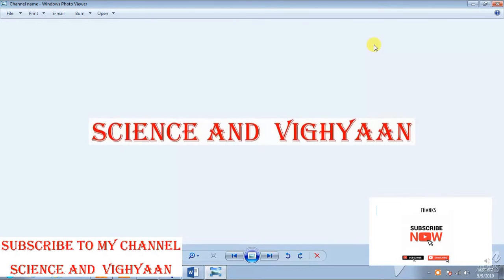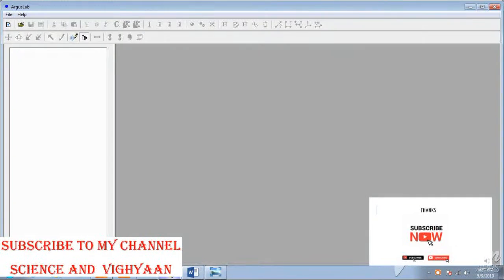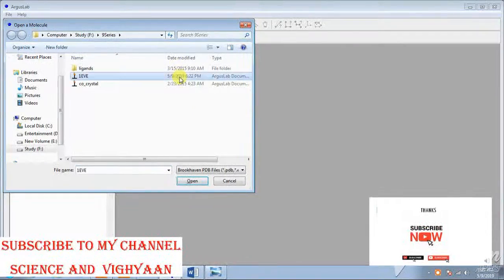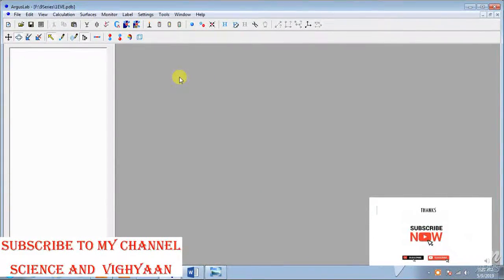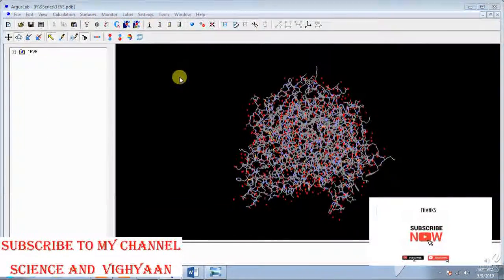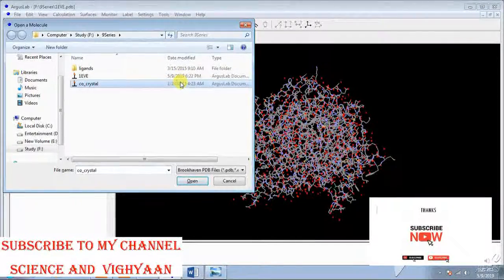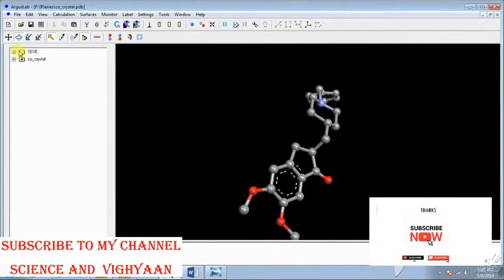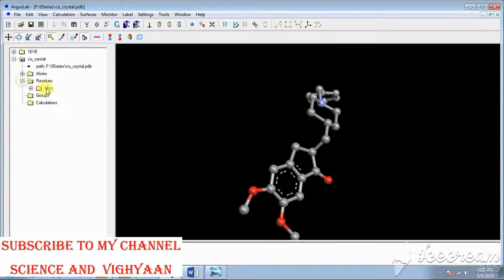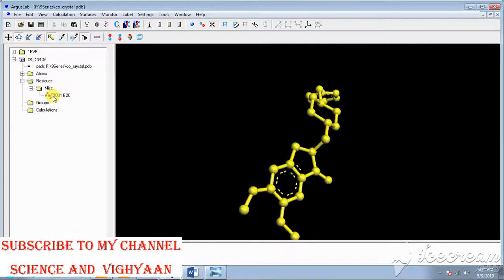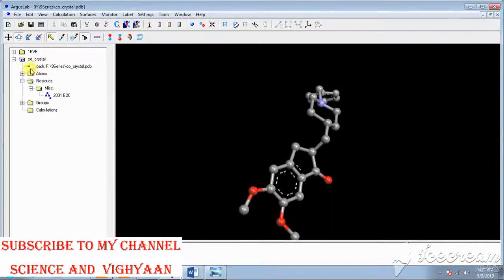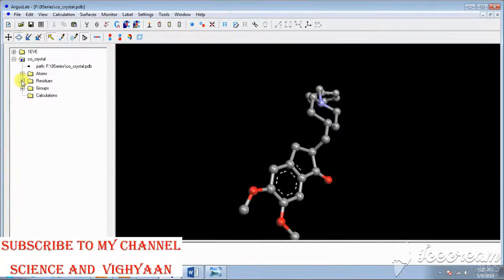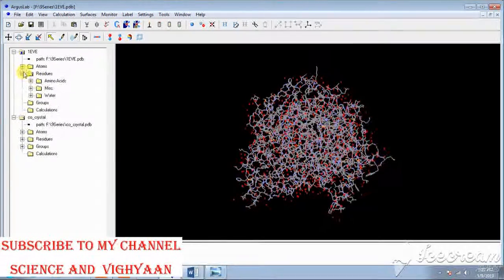Just open the Argus Lab software. Now open the protein structure, ligate, open the ligate. Now select the ligate, make a ligate. Now from the protein amino acids we have to choose.